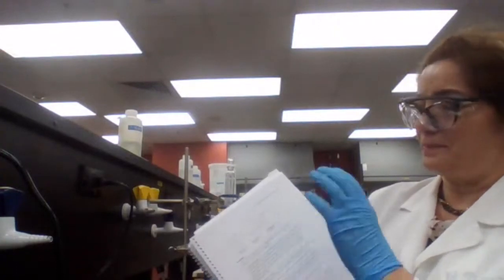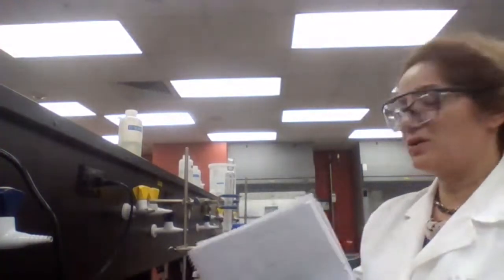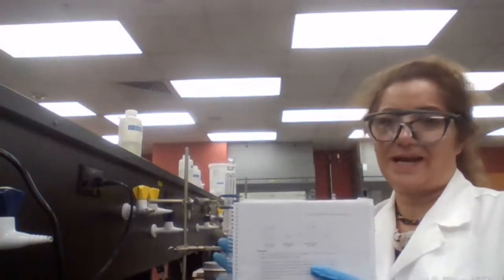a complete procedure or good design of the experiment should have a procedure part that is going to allow you to purify your product. Because when you get your product, you're going to get crude product. And what is crude product? It is the product that you think, or you assume, or you're sure that your reaction has taken place, but it's not purified. It's mixed with the excess amount, it's mixed with the catalyst, it's mixed with everything that you have in your reaction mixture. You're not going to get 25 milliliters of ester. 25 milliliters of ester is a lot of ester.